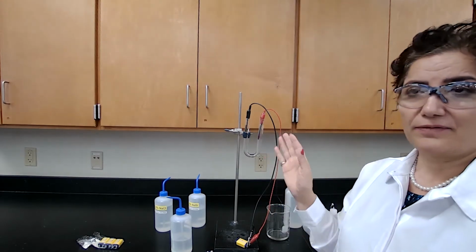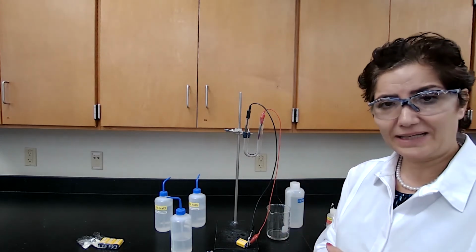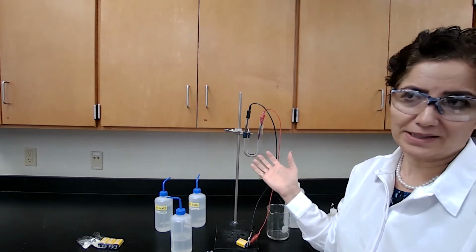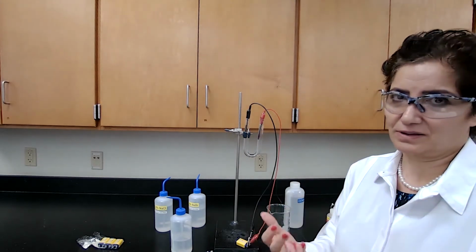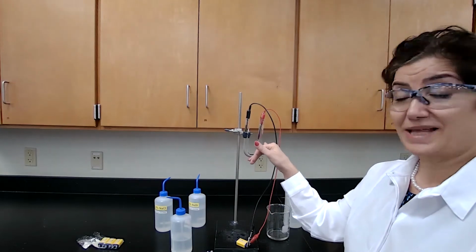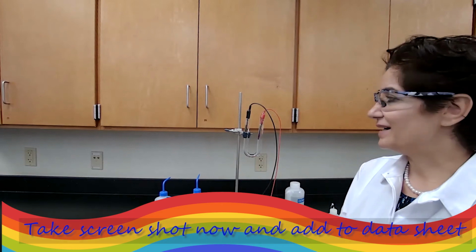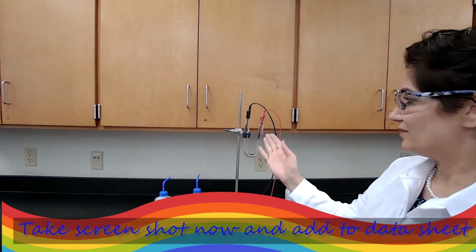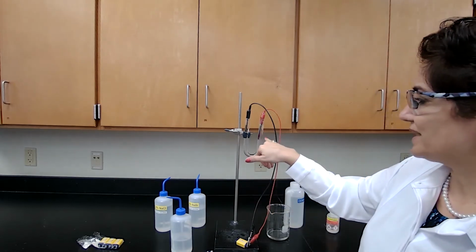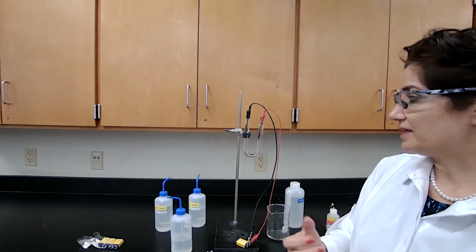So we had two choices for reduction. One, potassium can gain an electron and change to potassium metal. It doesn't happen in this case because potassium doesn't reduce that easily. It's a very reactive metal, and if we have metal potassium or metal sodium in water, it would cause an explosion, really. But it's proof that the water is being reduced in this case. So water is being reduced and hydroxide ion has been produced, not the potassium metal.